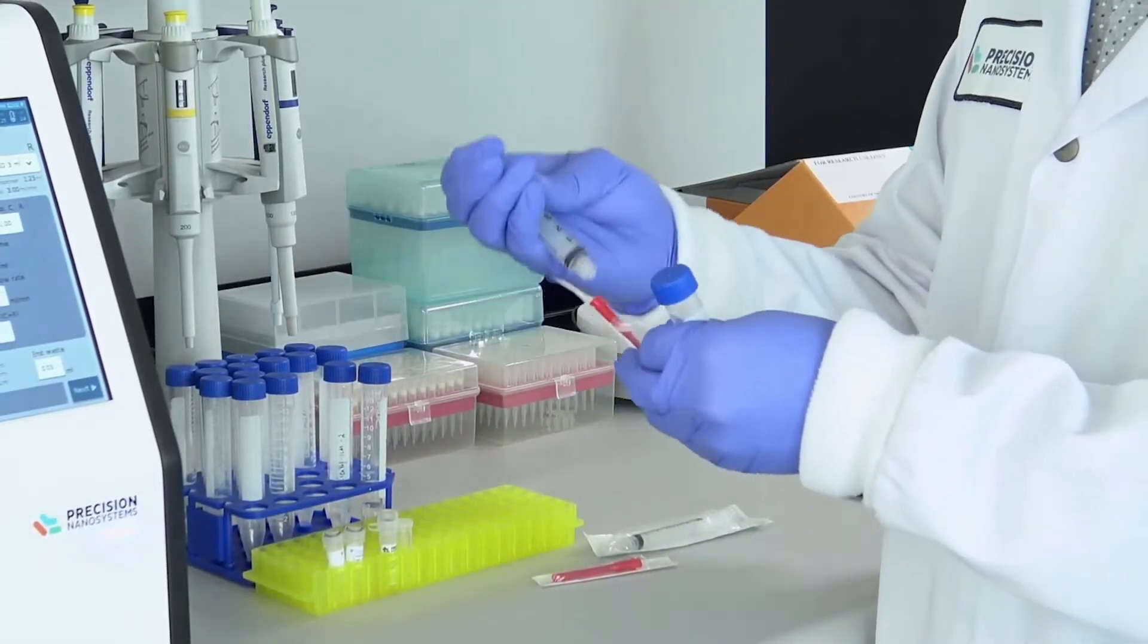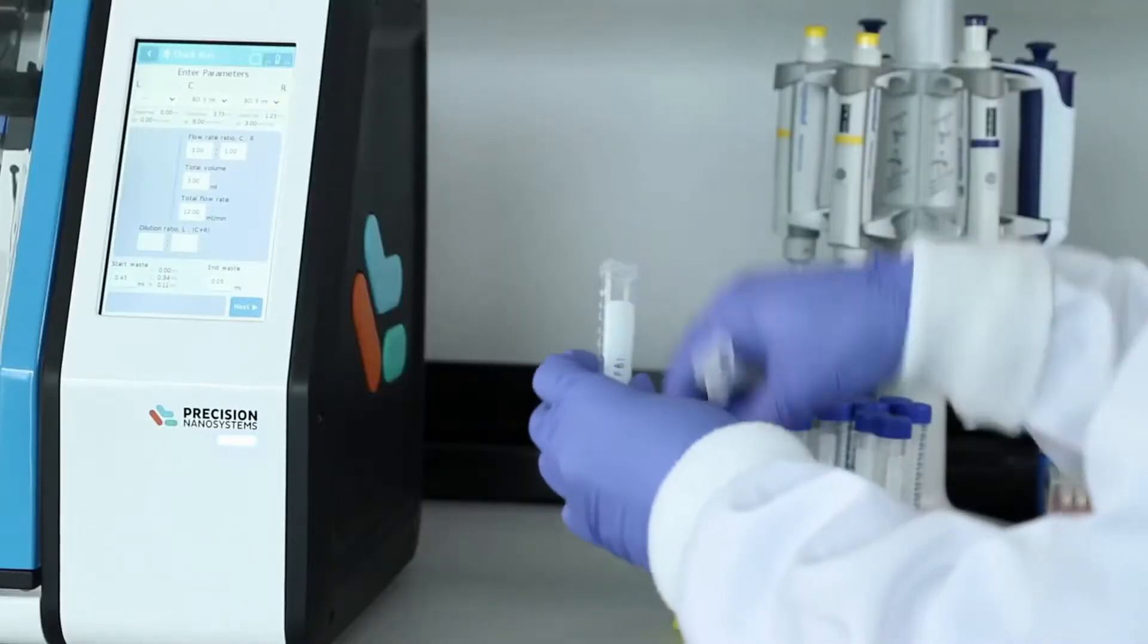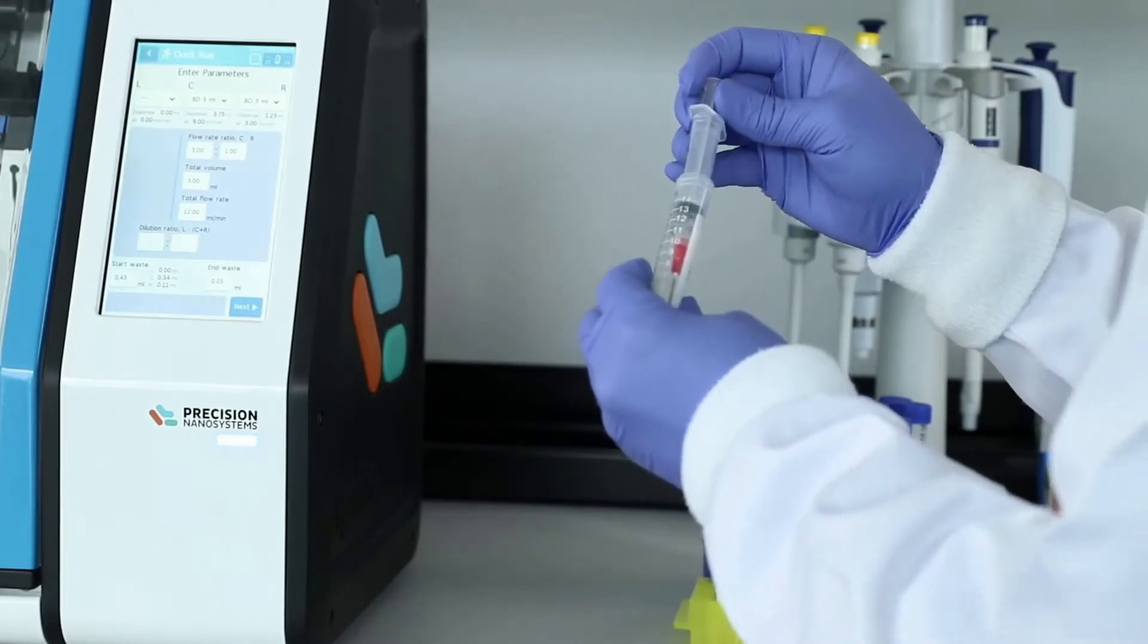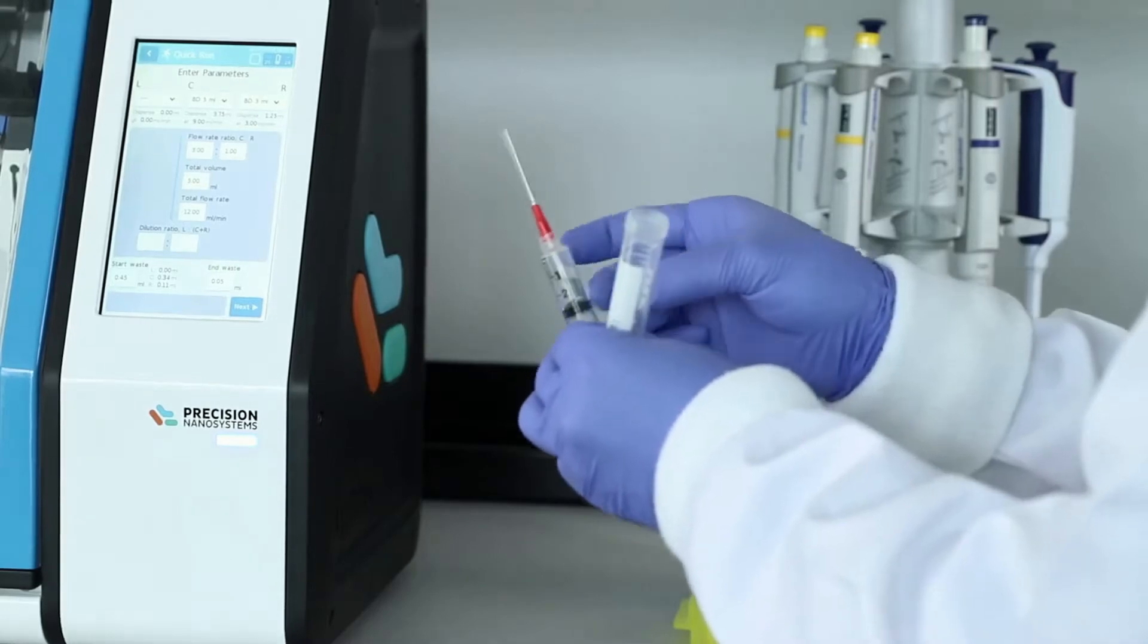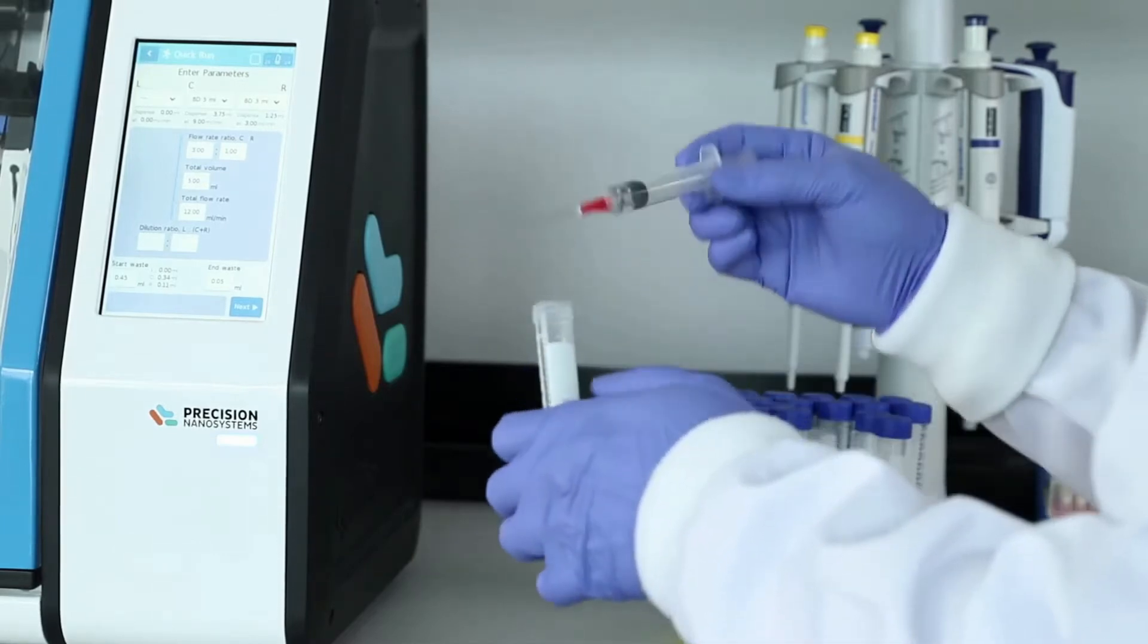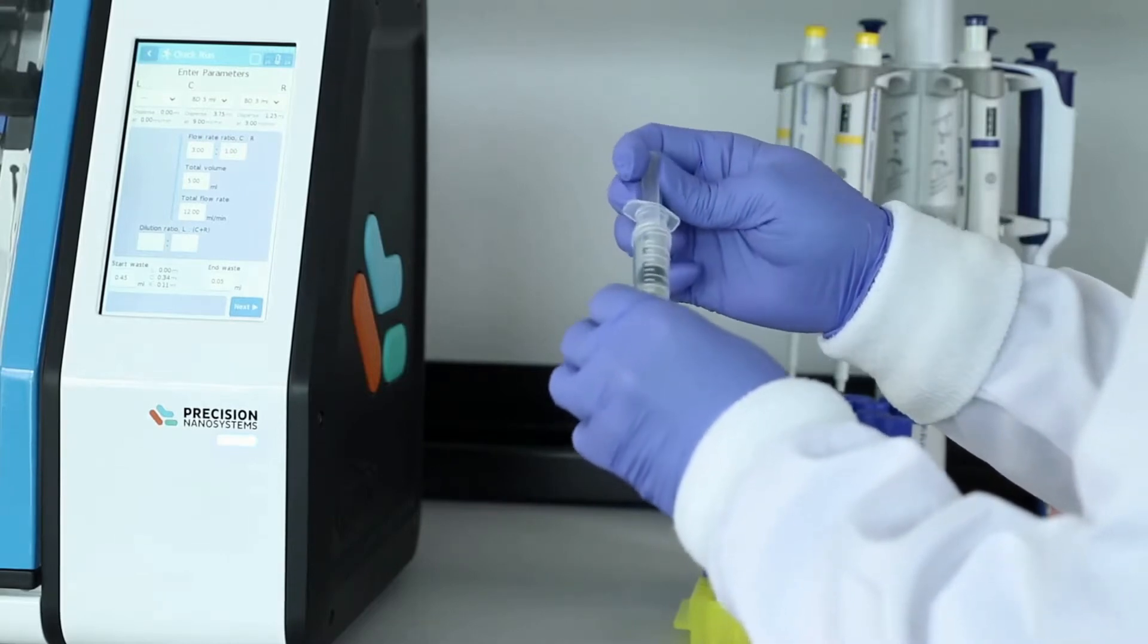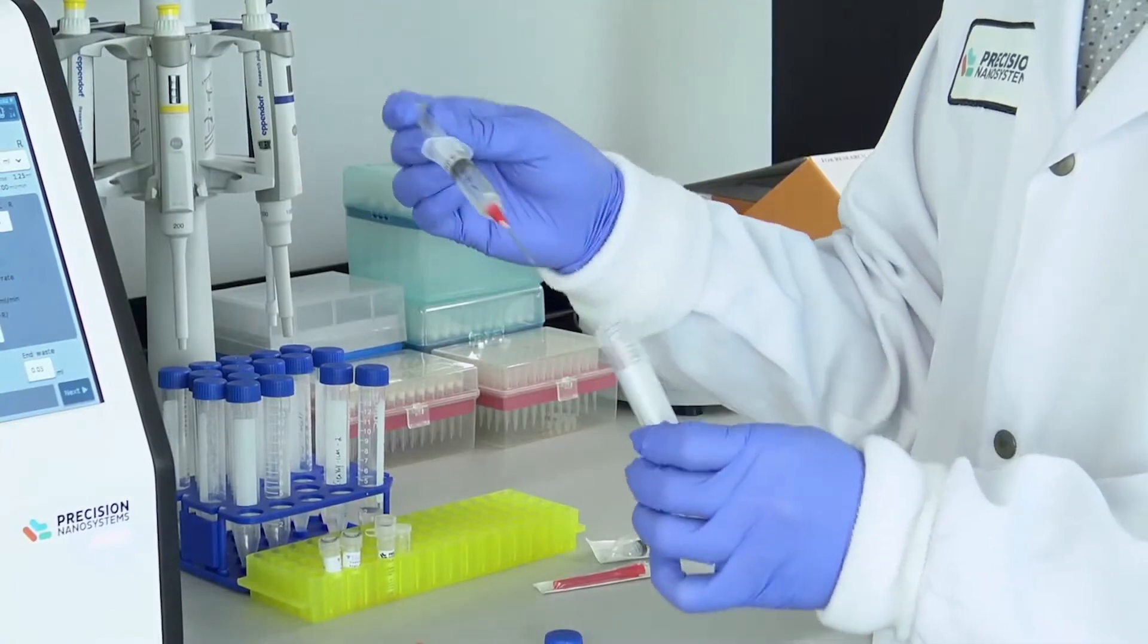It ensures the conditions are highly reproducible run after run, regardless of who's using it. Fluid input is handled through syringes which attach by luer lock directly to the Ignite cartridge. Here, RNA and an acidic buffer is loaded in a syringe, then our GenVoy ionizable lipid mix dissolved in ethanol is loaded in another.